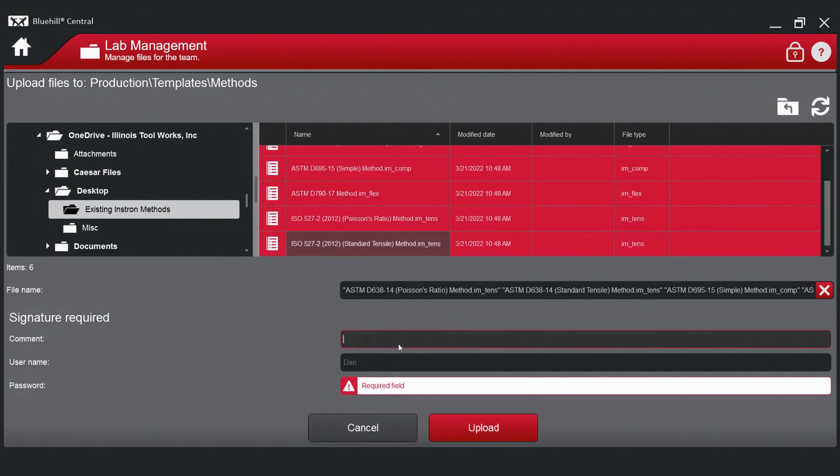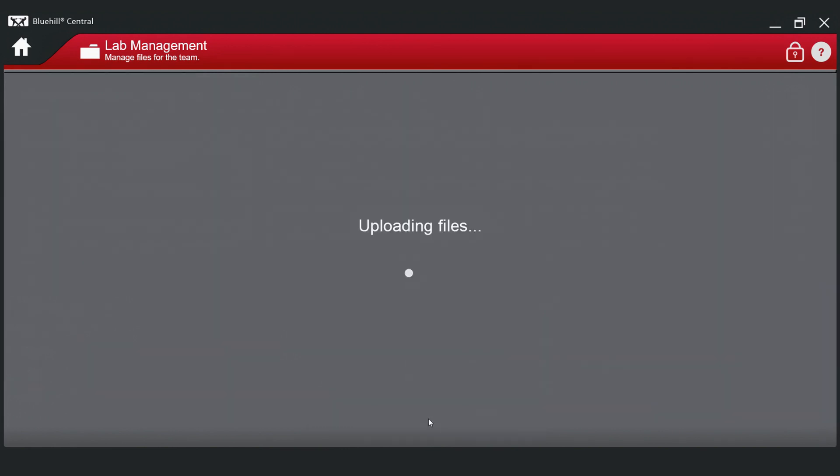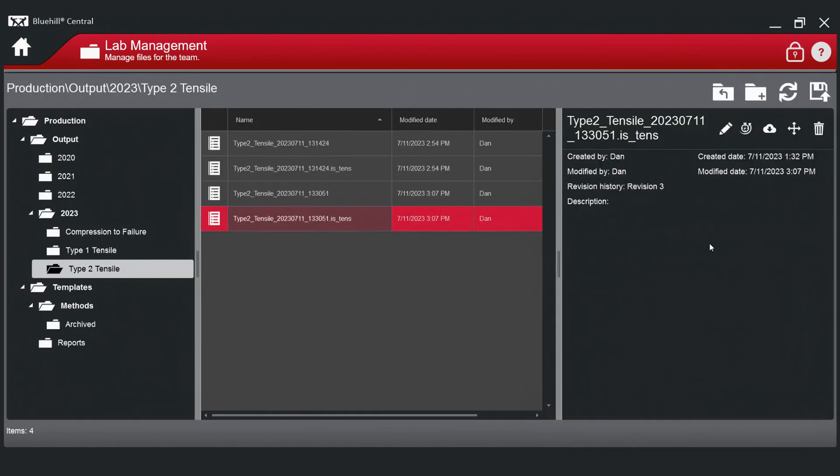Uploading existing files, such as test methods, can be particularly useful when first setting up your team, as you can upload multiple files at once.